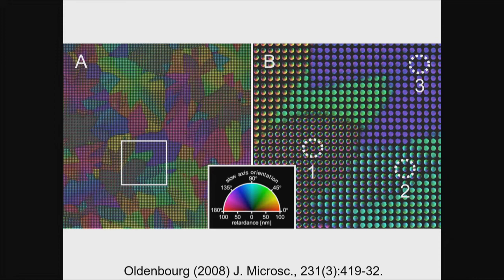So how much retardance is imprinted on the polarization of the light as it travels in different directions through this object. You can see that the one that is normal, at the center of this circle, are rays that have traveled parallel to the viewing direction, whereas these marginal rays that have a high angle have picked up quite a bit of retardance, whereas the one that travels right down the optic axis doesn't pick up any retardance.